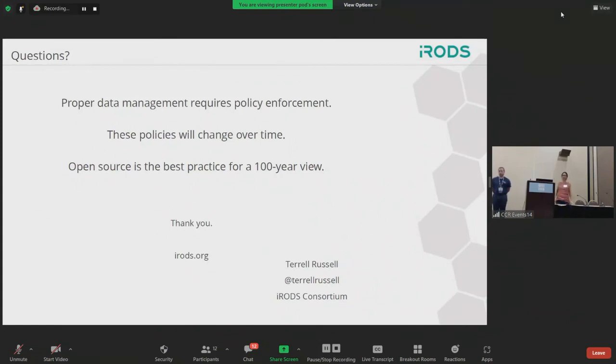So I had a question around data intermediates for when you are generating a bunch of different neural networks or any processing pipeline. What we've run into at the institute I'm from, NCATS at NIH, is that a single 1 terabyte data set will generate something like 50 terabytes of intermediate data. And we're saving all of it, but we're less than pleased with a 50x increase in data storage. And so setting up nuanced policies for data management has been something.